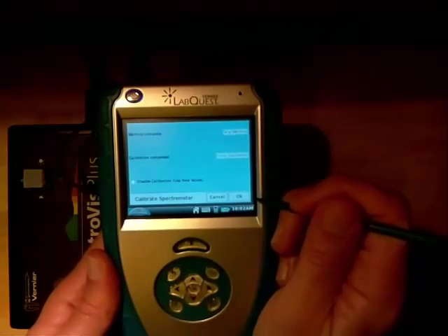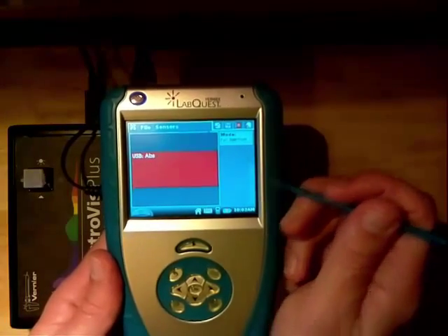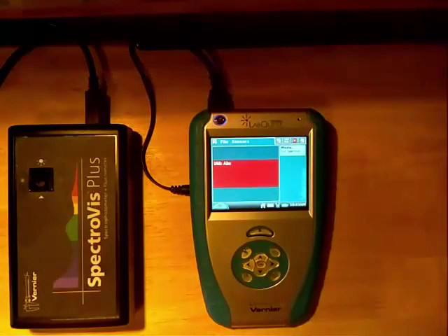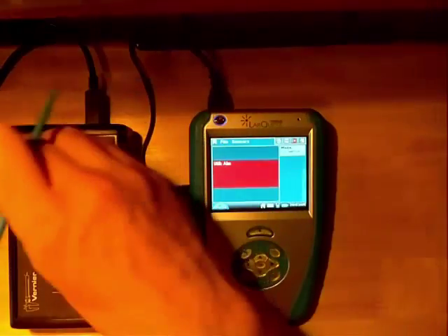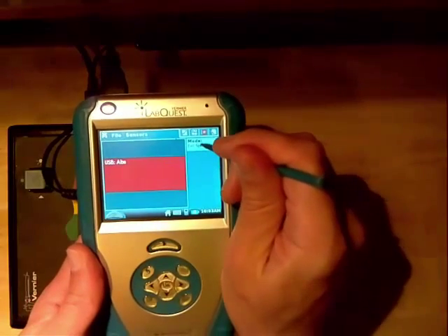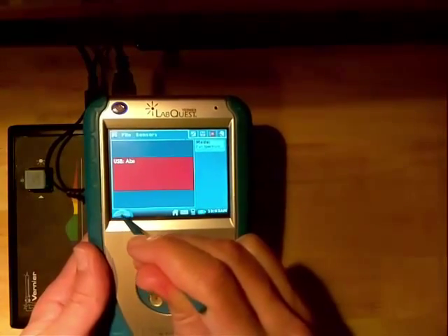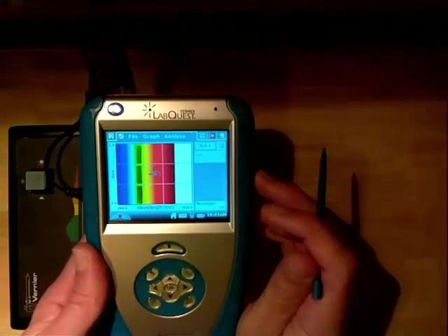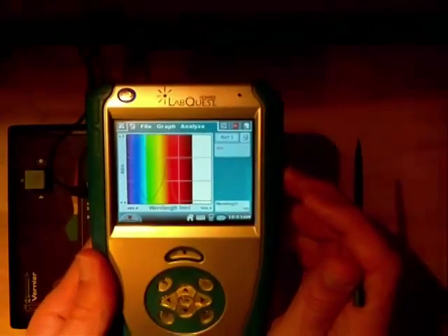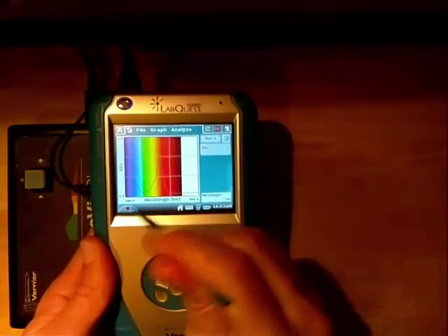Hit OK and now we're back. Let's go ahead and put a sample of interest in — I'm going to put in the dilute green sample. We are in full spectrum mode as shown here, and all I need to do is hit the play button in the lower left-hand corner. Up comes the spectrum. Before I manipulate it, I need to stop — it's actively collecting right now, so I'll hit the stop button.